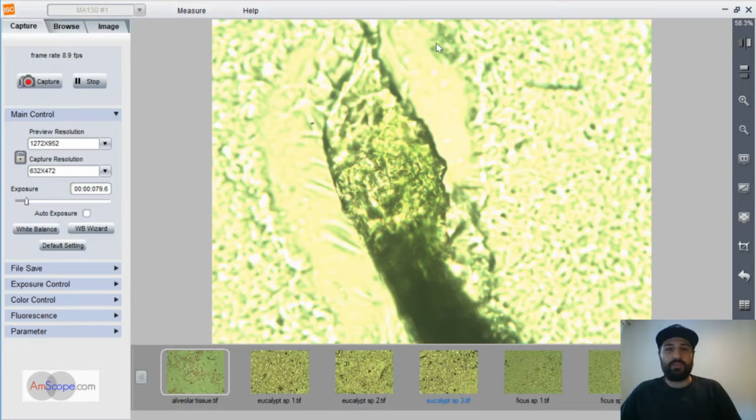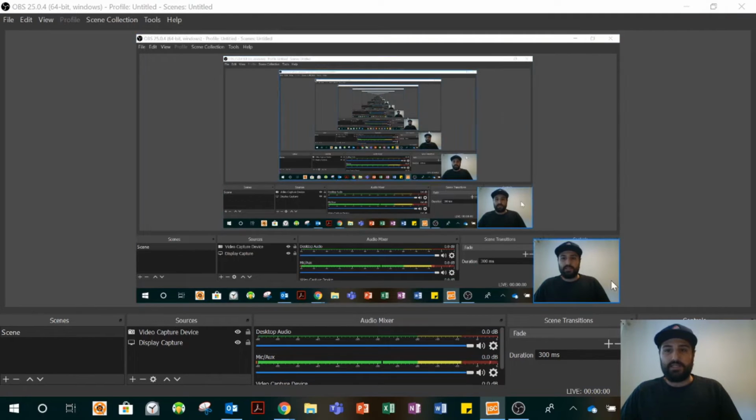But for our purposes of observing leaf structure in the practical investigation, this is not going to be really that useful for us. But it's good to see that there is a different way of doing it, especially if you can do it properly. You can get good results, and the one I'm going to show you now is one that will be a bit better for us to do this practical. So I'll get that slide up now.